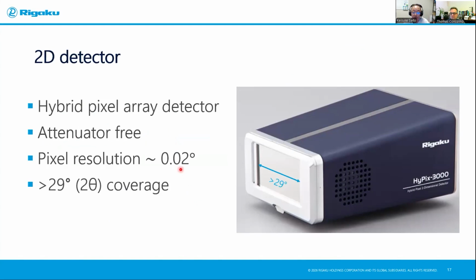Okay, very good question. Thank you. The XRD profile you see on the screen from the diffractometer is a convolution of every broadening caused by everything: for example, the X-ray source, optics, slit, sample, and detector. So the detector resolution is one of the resolutions convoluted in the profile.